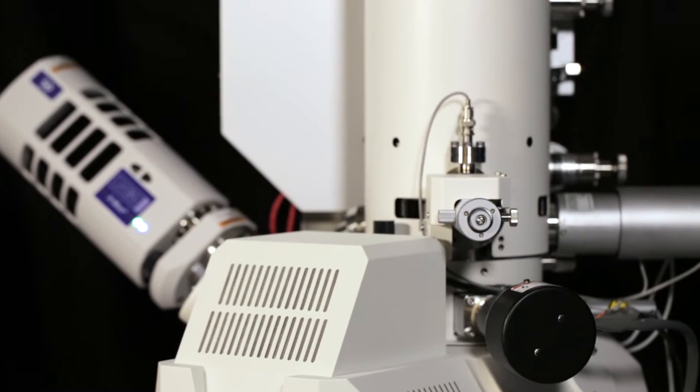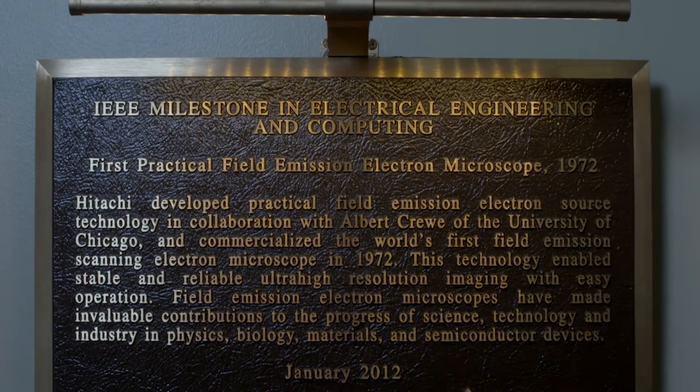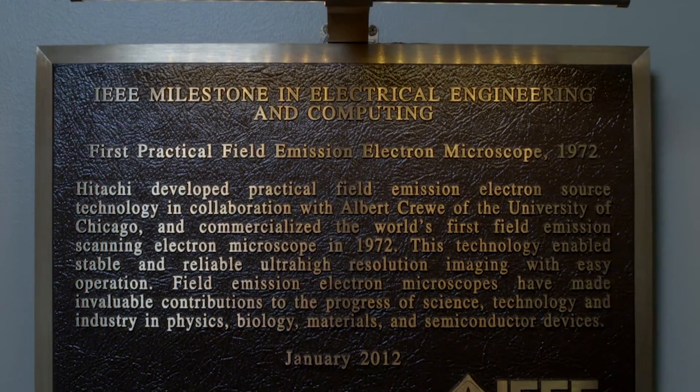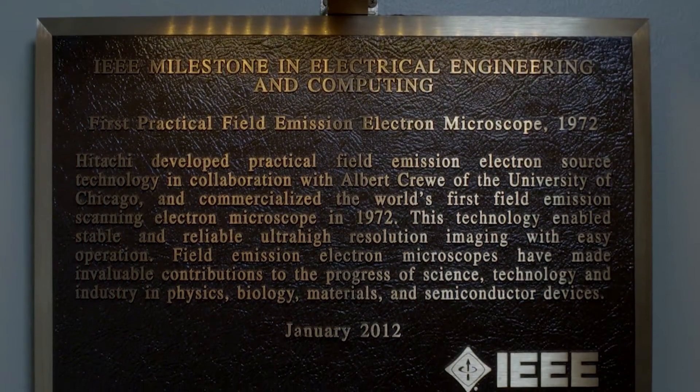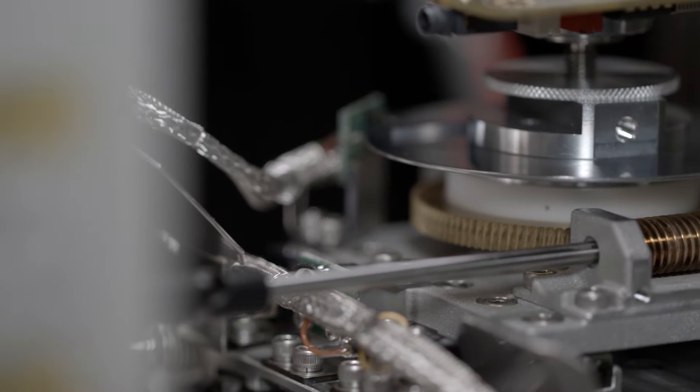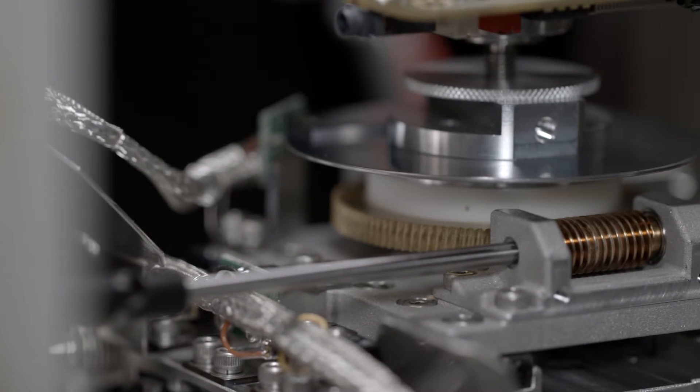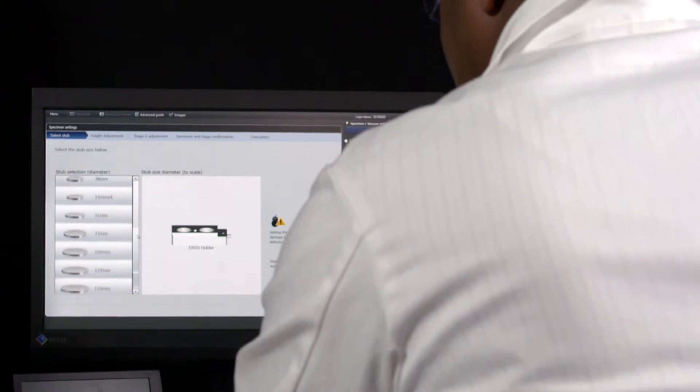Having been recognized for their significant contributions in the development of field emission electron microscopy, and with the introduction of the SU-5000 and its revolutionary FeSem gun technology, Hitachi once again raises the stakes in image analysis instrumentation.